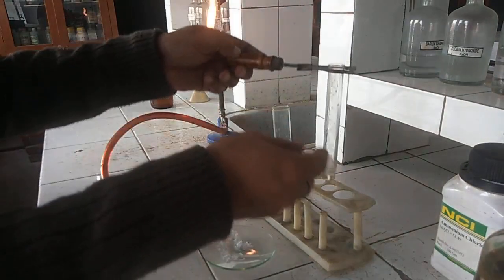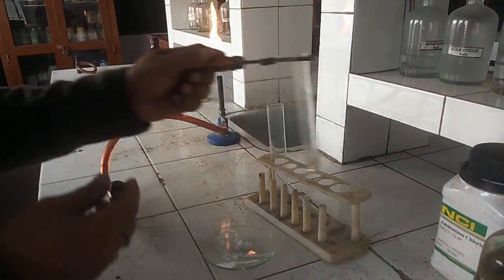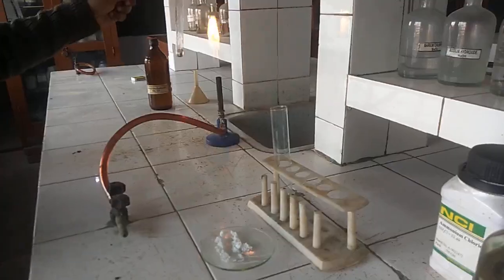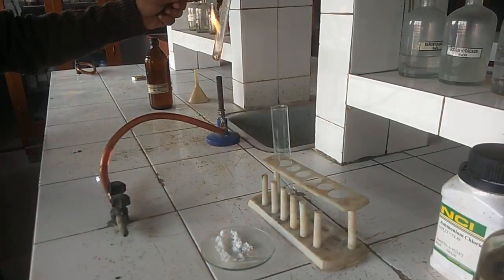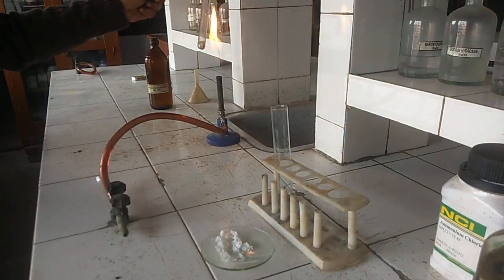Now we have to heat this test tube. For this, we will hold the test tube with the help of a test tube holder, and we will heat this content over the Bunsen burner.